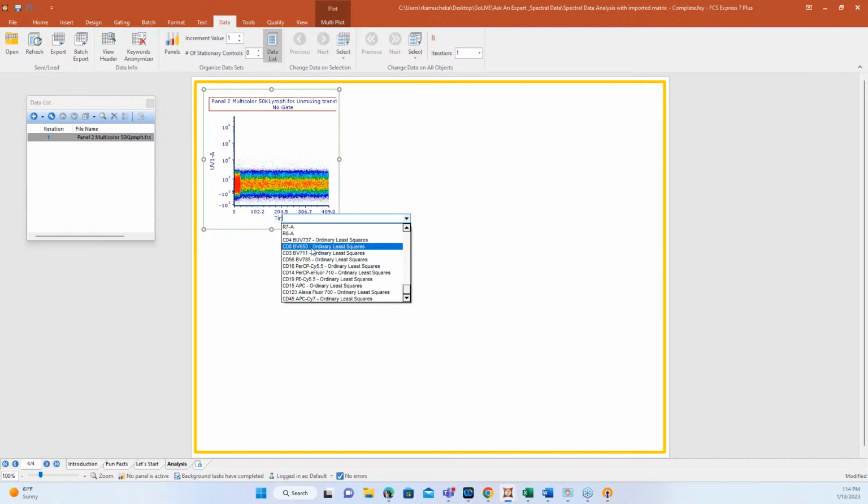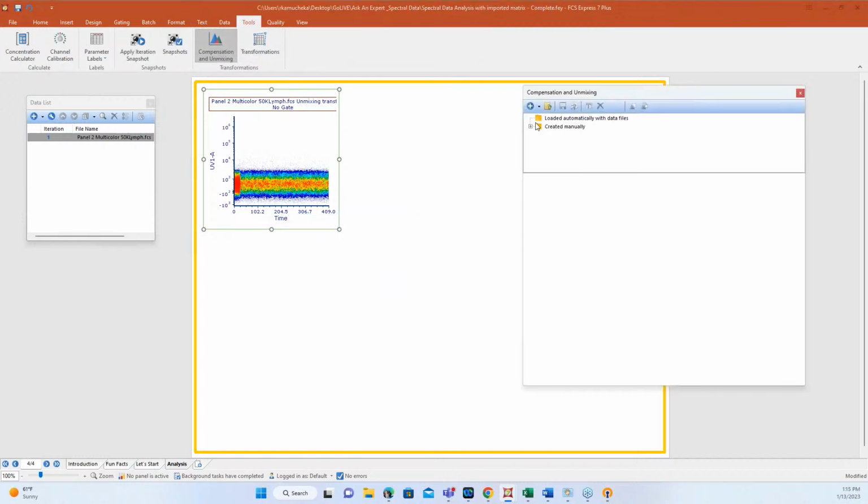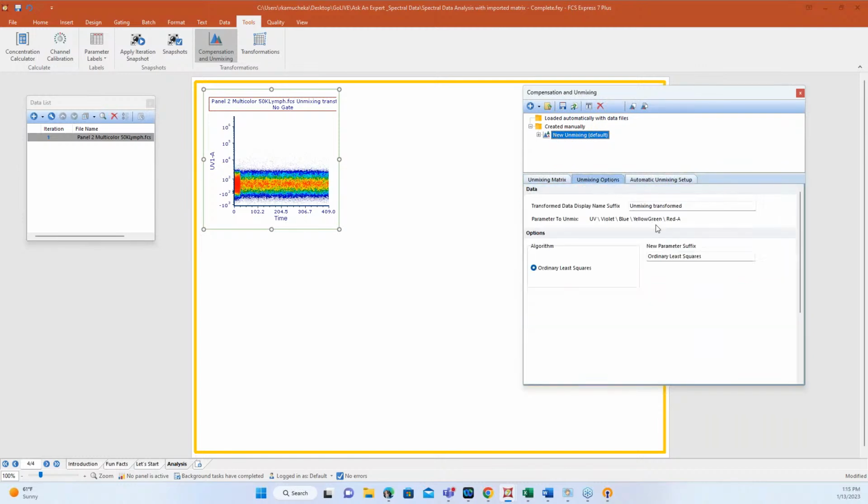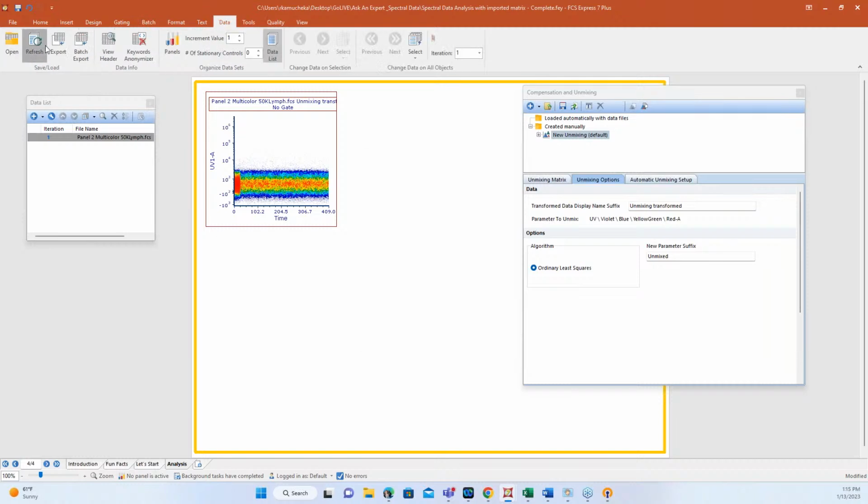Ordinary least squares is the default nomenclature that we add. You can totally change that, because that is not my favorite. I'll be honest, I generally change this. If you see it and think, nope, I don't like that, you can go to our unmixing options and change it. If we change it here, say to unmixed, and click okay, the next step will really be to reload that data. So I do a quick refresh.